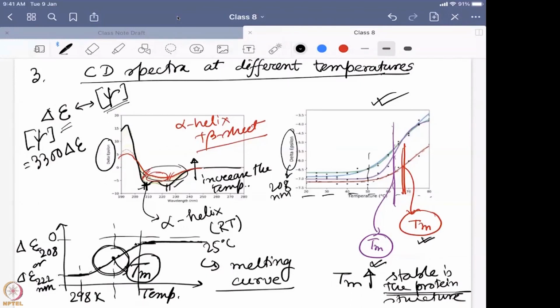So CD spectroscopy was a huge player in finding out whether the protein structure is really playing a role. And when they did the CD spectroscopy at this temperature, they found, yes, the melting temperature measured from the CD spectroscopy shows a huge difference between this particular biological system surviving near underwater volcanoes and the other parts of life.